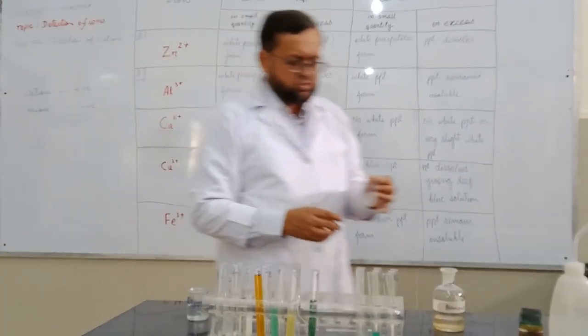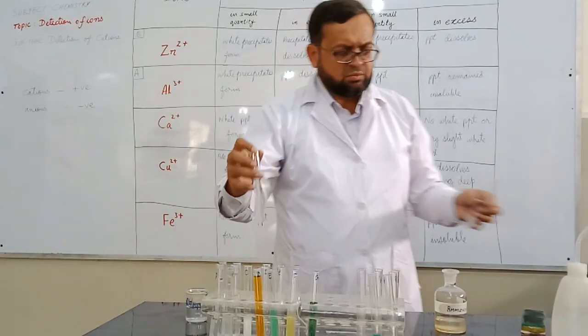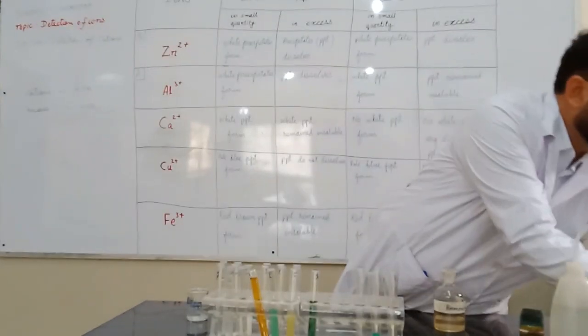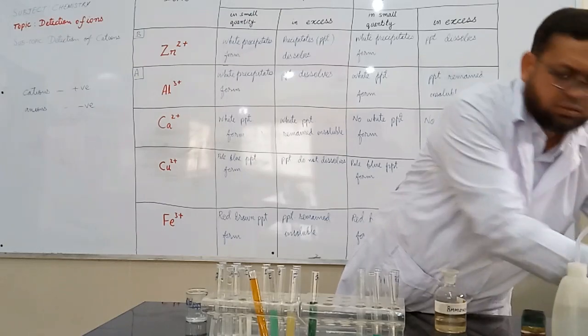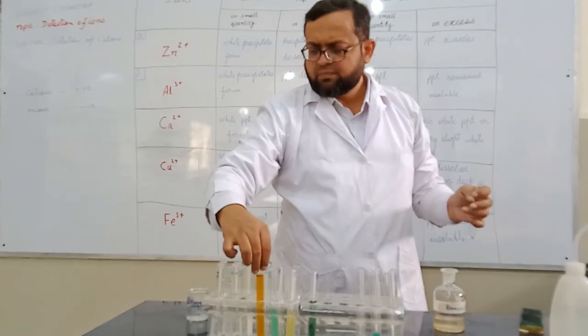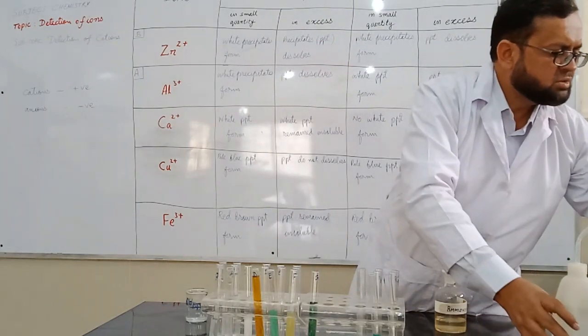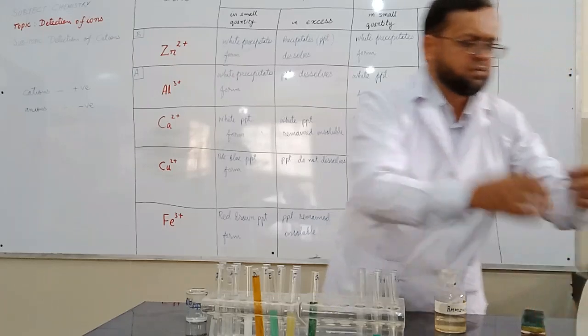I think I should perform this test again, because I think the solution is more concentrated, so I should dilute it.